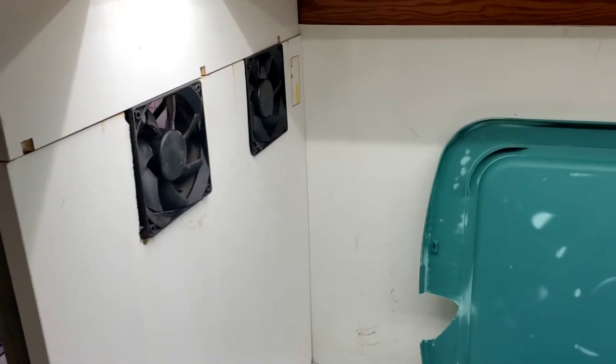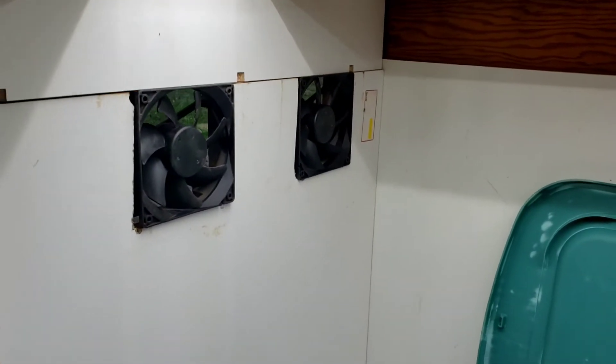Yeah, I haven't done a lot to it and it does look like crap, but I know these fans will deteriorate.